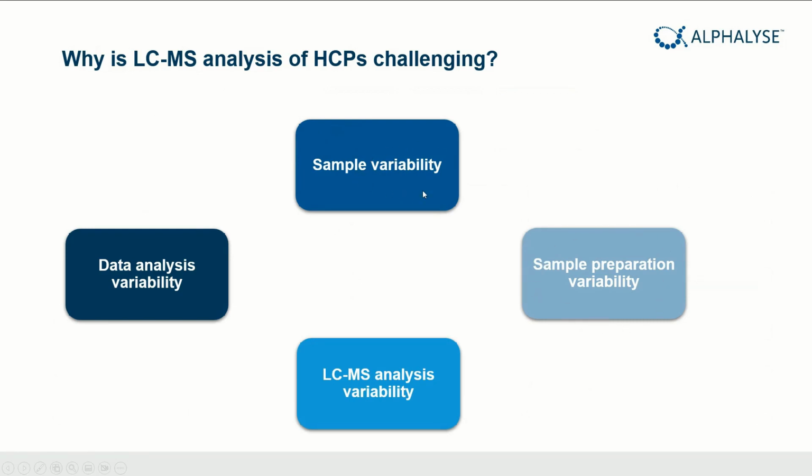Then you have the sample preparation variability. We cannot analyze the proteins directly. We have to prepare the samples for the LC-MS analysis. This sample preparation has many, many steps. We need to reduce and alkylate cysteine, digest it into peptides, clean up the peptides, and this is all variable.